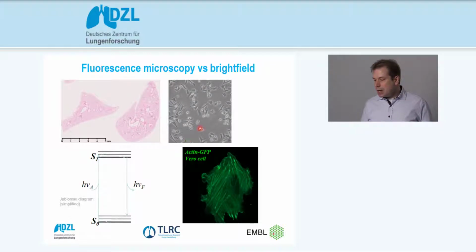As you can see here in this phase contrast transmitted light image, we can see cells and even identify perhaps individual organelles, but we don't know their identity. In tissue sections that are stained with specific stains, we can identify classes of proteins, lipids, and, for example, mucus. But still, we cannot pinpoint an individual molecule. And this enables us fluorescence microscopy.